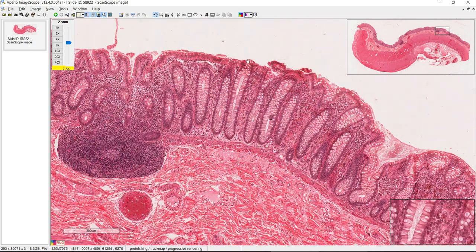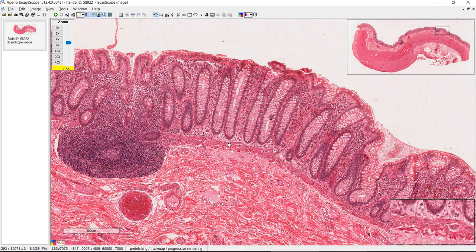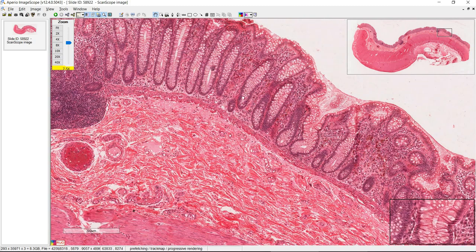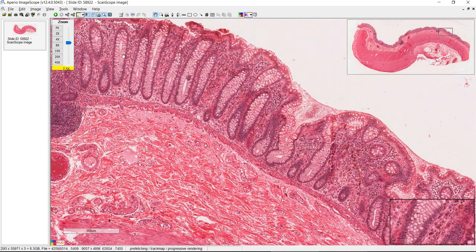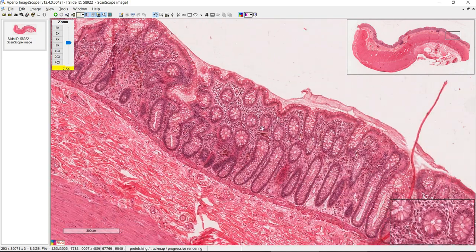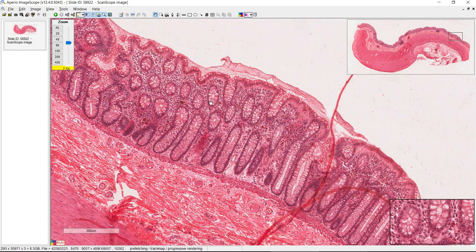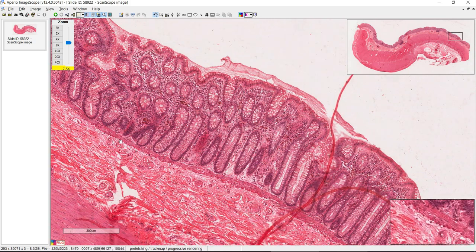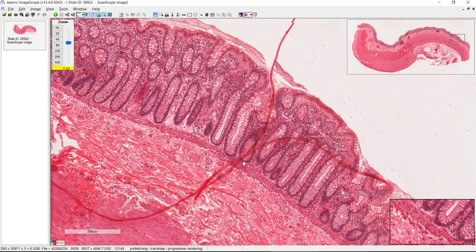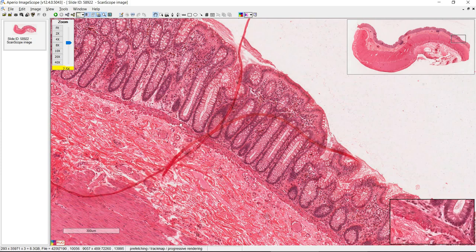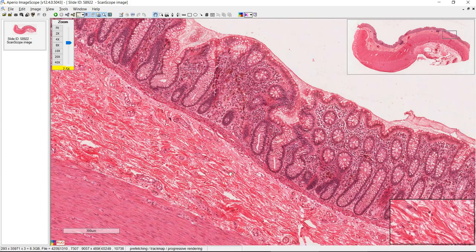The manual points out that the crypts of Lieberkühn go all the way down towards the muscularis mucosa. You can see some longitudinal sections over here and cross sections of crypts over here. In addition, we can very clearly see the muscularis mucosa, whereas in some of the small intestine slides it's a little harder to see, especially when there are so many glands in the submucosa.